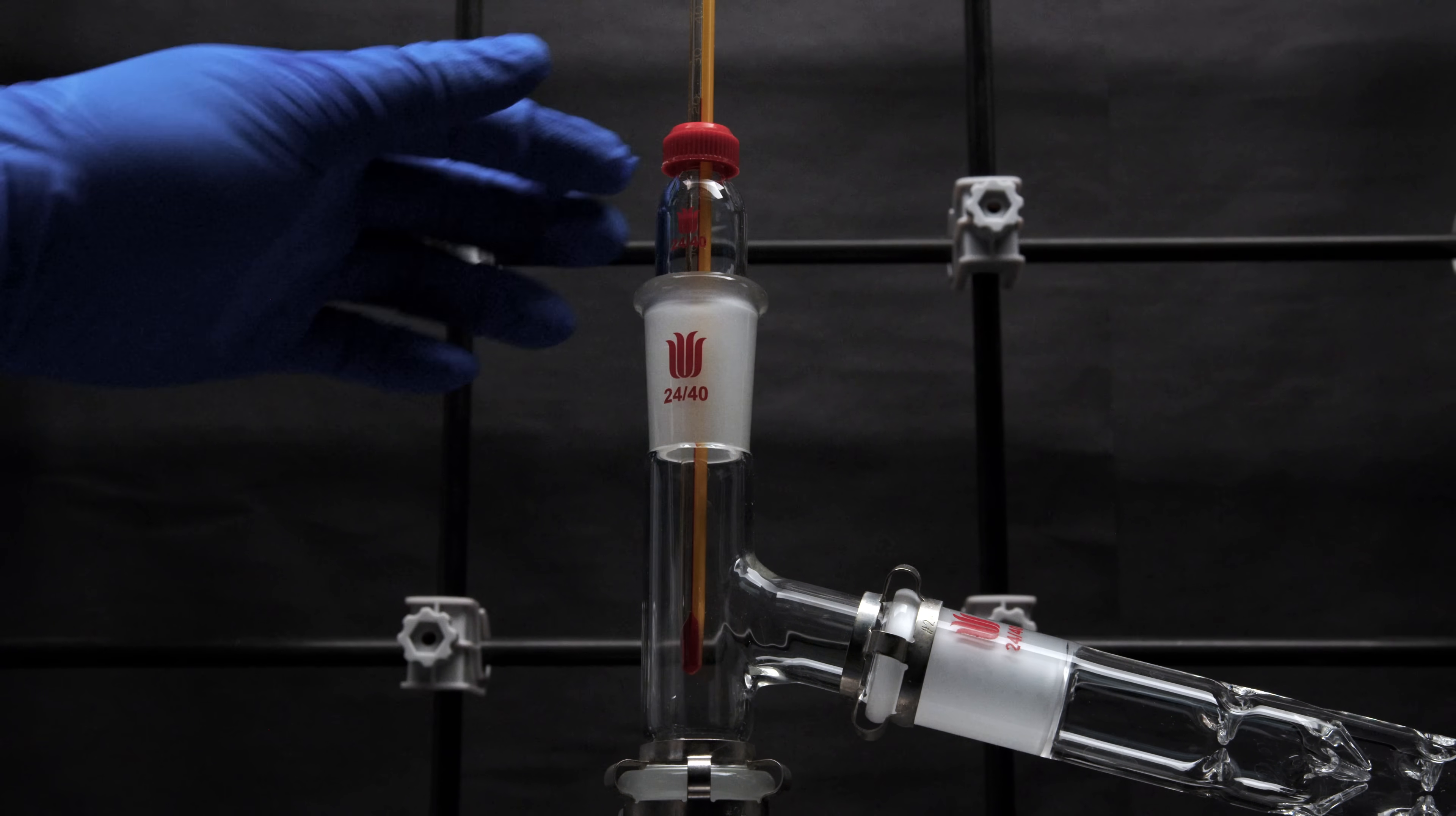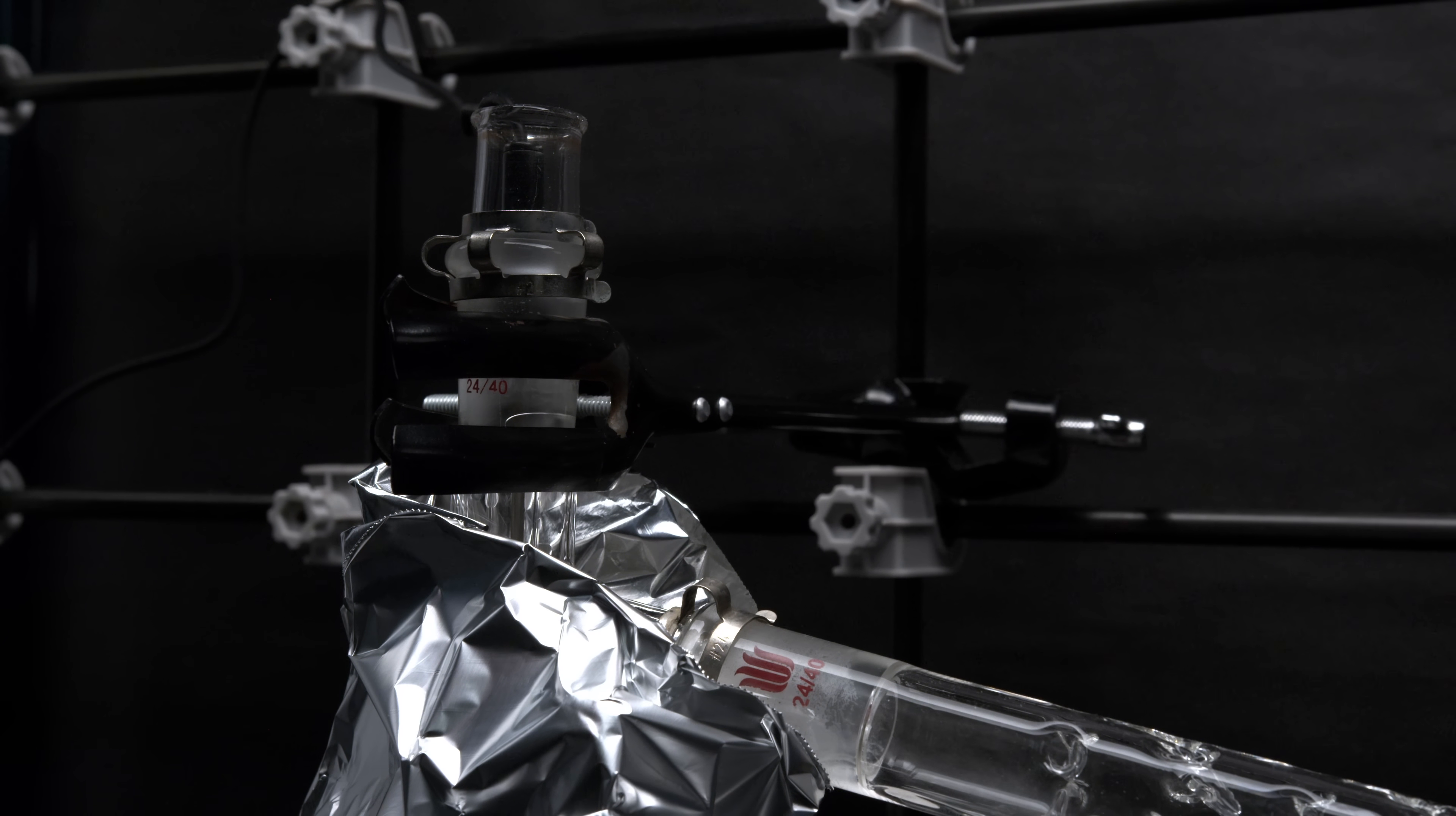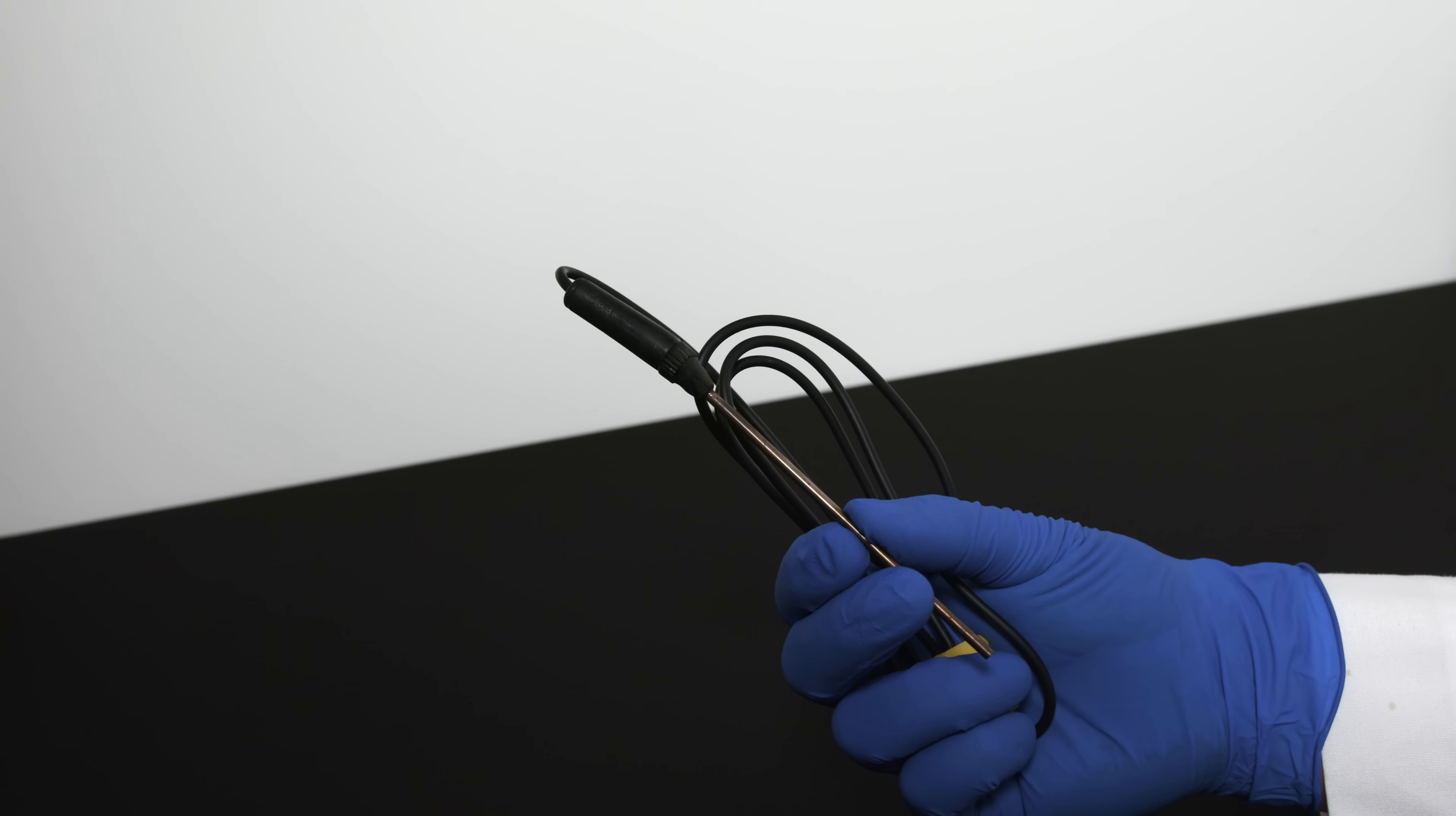For those who don't have access to the luxury of temperature measurement, don't worry, because it's not that important for this particular experiment. You can use the distillation adapter with the thermometer insert for this experiment. The procedure for the distillate collection part will be slightly different though, and I will explain later in this video. For those who can measure the distillate temperature, simply wait for the distillate to go up to 337 degrees Celsius or stabilize somewhere close to it. Because my thermocouple is actually measuring the glass jacket rather than the vapor directly, so you should expect the temperature measured to be slightly lower than 337 degrees Celsius. Also, just a side note, if you insulated your setup too well all the way to the distillate head, the glass jacket or the thermometer holder might just get too hot, which melts plastic.